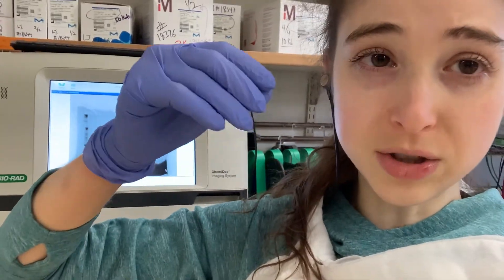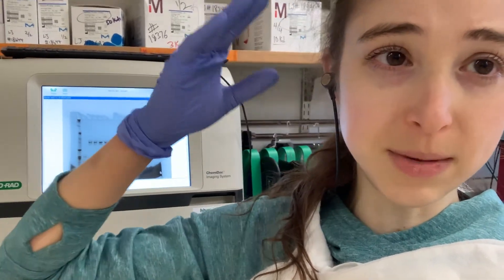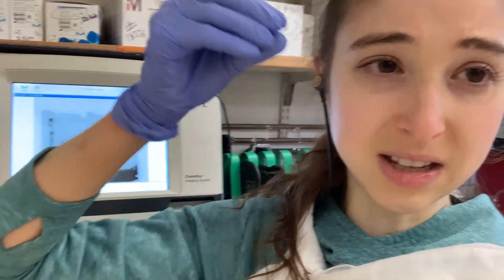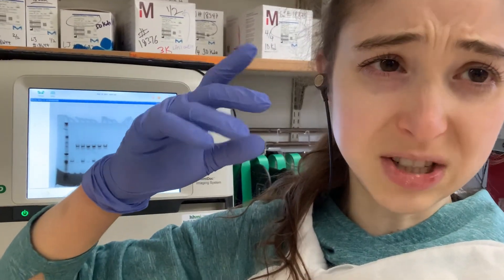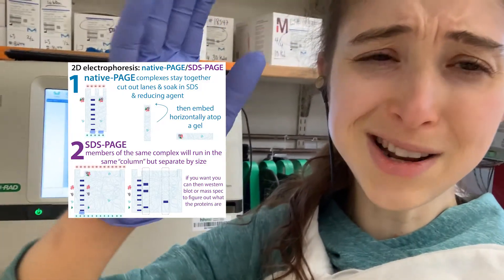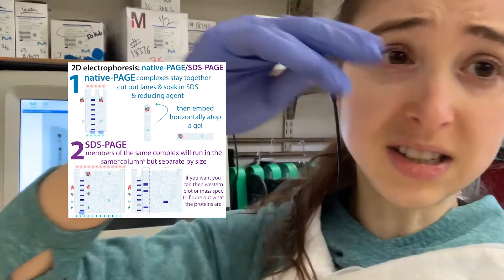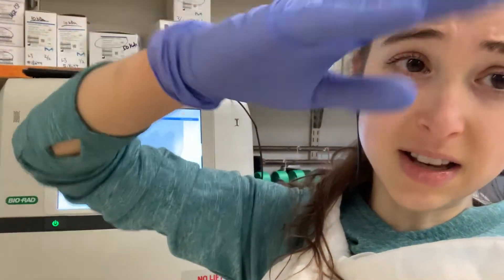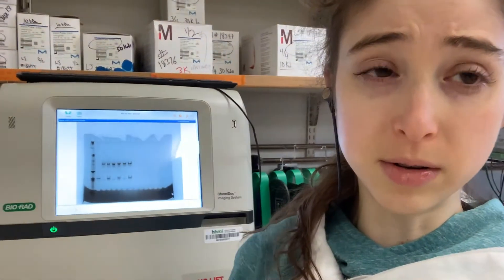But if you're going to do something further - like take the bands out, or do a second dimension PAGE - there are different things you can do, and you're not going to want to fix them in place. Look at the protocols if you want to know more. Like a second dimension PAGE, which I talked about yesterday: you cut that band out, soak it in SDS and denaturing reagent to denature the proteins while they're stuck in place in the gel, then take that band, turn it on its side, and run it through SDS-PAGE. That way you're separating the components of the complex.